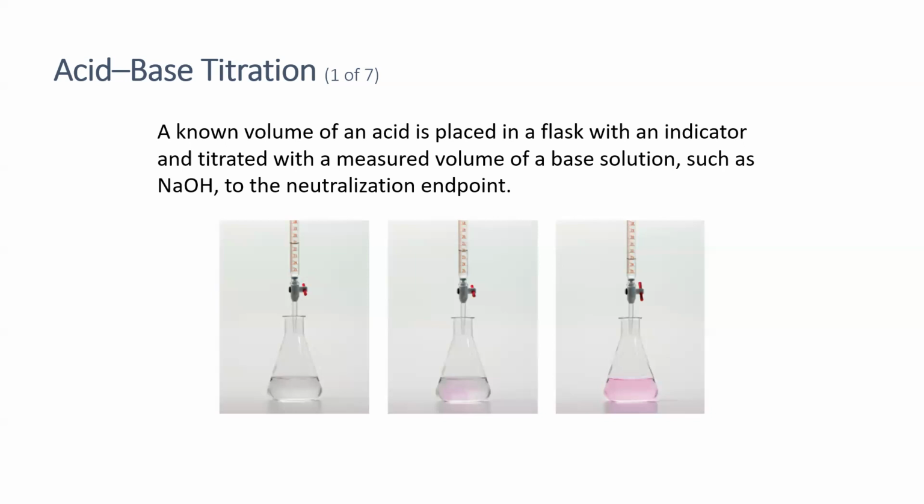So as the sodium hydroxide gets introduced, a pink color will appear, but as the sodium hydroxide has a chance to swirl around and react with the H+ ions, the color will go away. The color is from an indicator. We actually put a drop of phenolphthalein indicator inside that Erlenmeyer flask, and it's colorless before the endpoint. So when the solution is still acidic, it is colorless. But once it reaches that endpoint and there's excess hydroxide ion in there, a pink color persists.